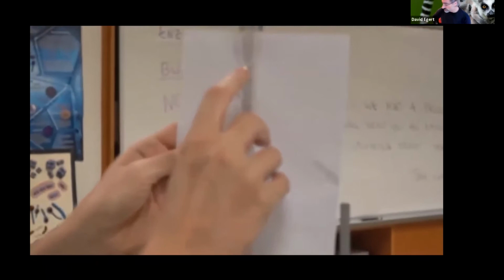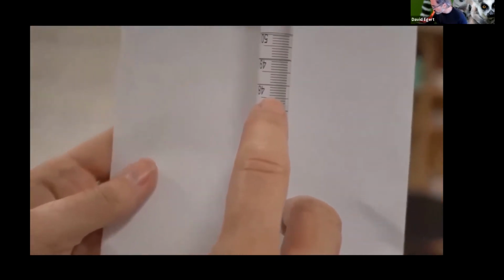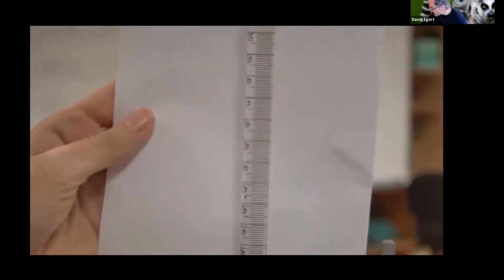Of course, now 50 is up here and 0 is down there. So, for example, if the level was here, that's actually 47.5. Then this would be 48, and so forth. So take a moment and get really comfortable reading this, because it is a little bit stressful when you're going through the experiment.